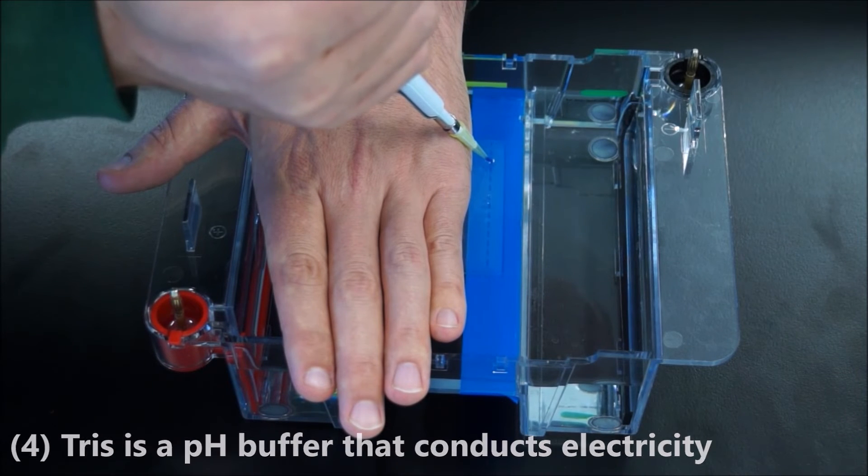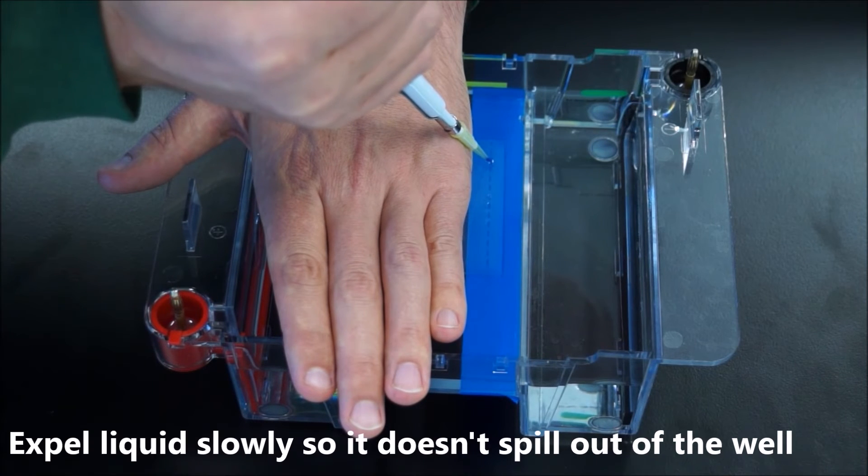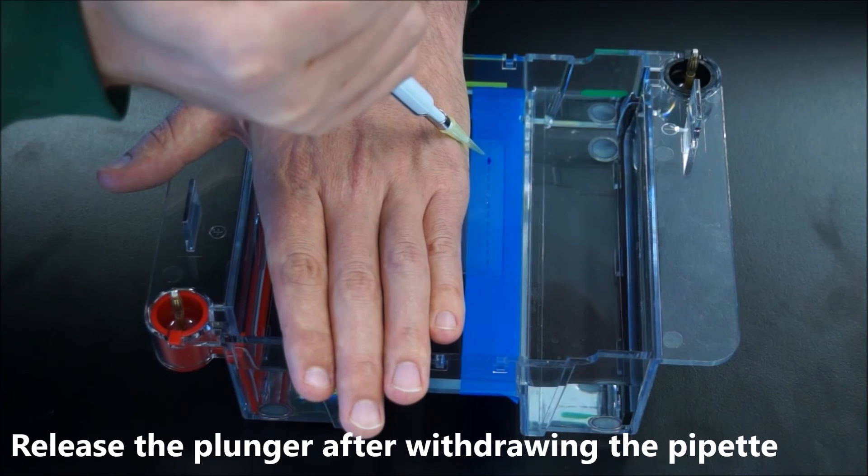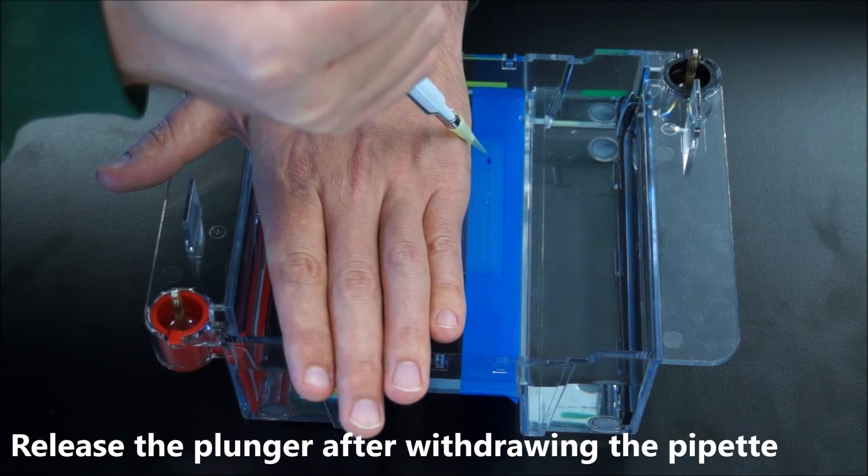Now when you expel the liquid, make sure you do it slowly. If you do it too quickly, it will force liquid up and out of the well. Once you have delivered all of the liquid, pull the tip out and then release your thumb off the plunger.